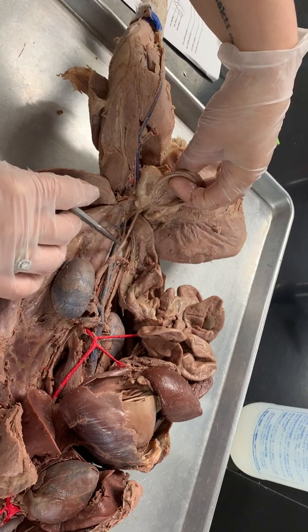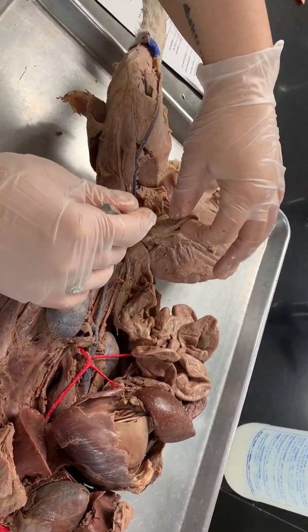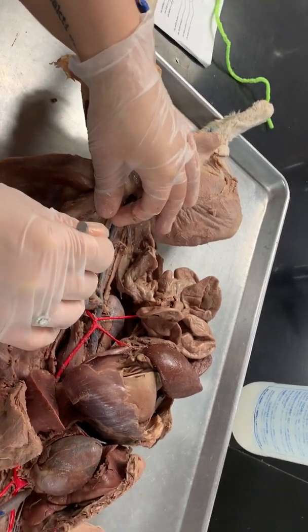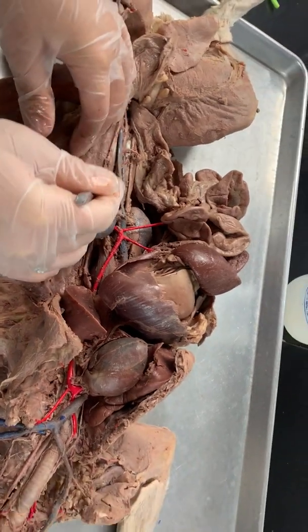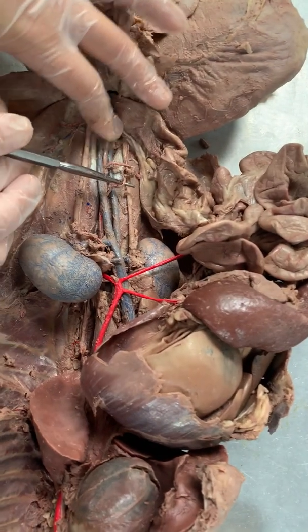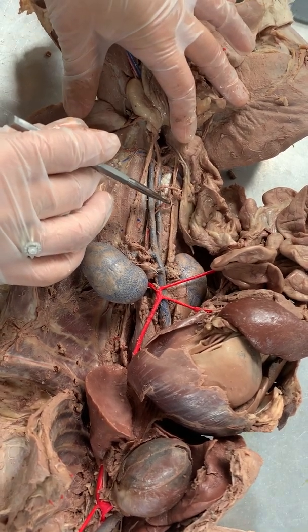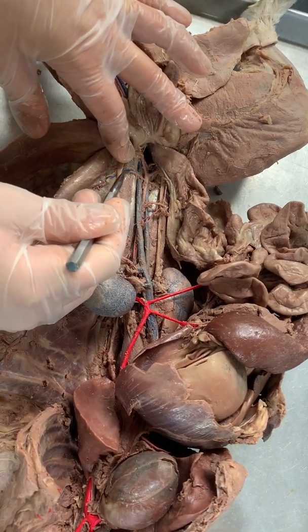Here's a nice ureter just for fun, just to show you guys. That'll be on your next exam, going from the kidney to the bladder. This is a bladder. See if I can find a nice gonadal on here for you guys. I think it was cut right here. Ah, here's one. Here's a gonadal artery coming down. If you ever find something kind of stringy coming up from the kidney region going down towards the gonad region, that's your gonadal. Here's your iliolumbar.